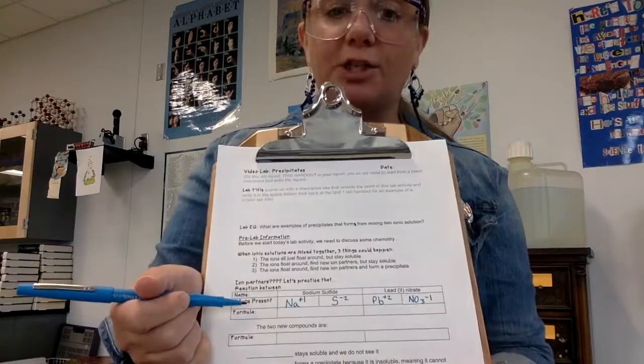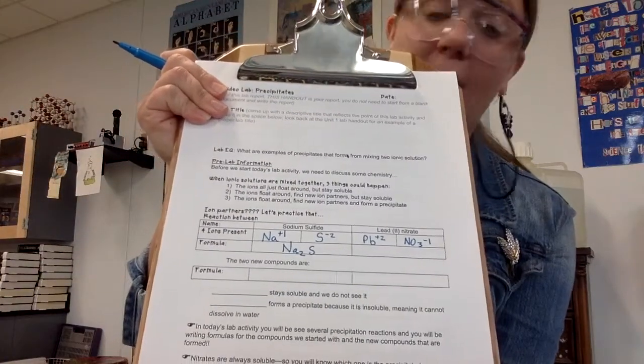It does also ask you to write the formula for the starting compound. So let's actually do that first. I got ahead of myself. I was excited about the precipitate. Na is a +1, S is a -2. So if I have 2 of this whole thing, you'll have +2 to balance out that -2. So the first compound formula would be Na2S. So that's my first compound that I'm starting with.